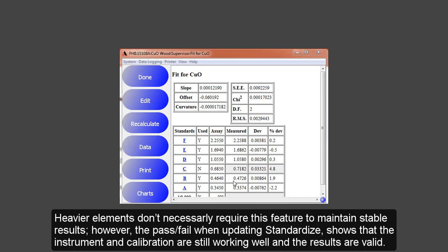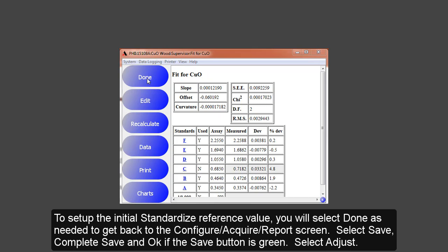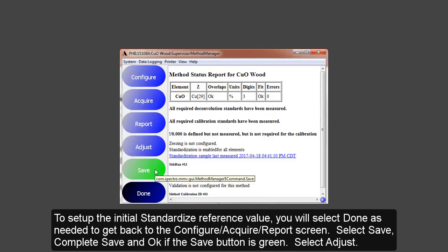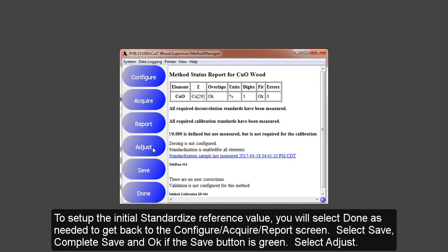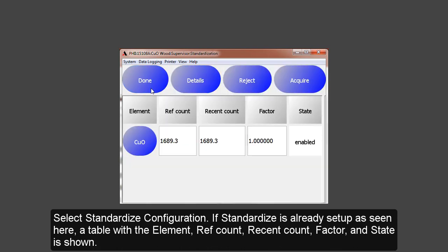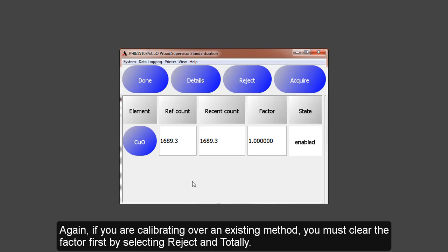However, the pass-fail when updating standardized shows that the instrument and calibration are still working well and the results are valid. To set up the initial standardized reference value, you will select Done as needed to get back to the Configure Acquire Report screen. Select Save and Complete Save so all your calibration information is saved. Select Adjust, then Standardize Configuration. If the standardized is already set up, the table with the element, reference count, recent count, factor, and state will be seen. Again, if you are calibrating over an existing method, you must clear out this factor if it is not 1 by selecting Reject and Totally before you calibrate.